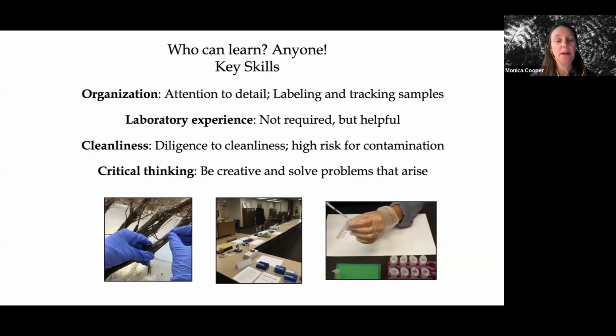It helps if you have laboratory experience, but we found that it's really not required, although you do have to be dedicated and diligent about being clean. There is a high risk for contamination. Once you have the DNA somewhere that causes contamination, it can be really difficult to clean that up. So you really want to make sure that you're keeping your space clean, that you're cleaning your hands and your equipment and your tabletop, and that you're keeping any samples in a place that's not contaminating where you're running the assay.